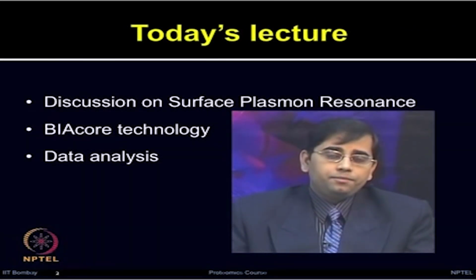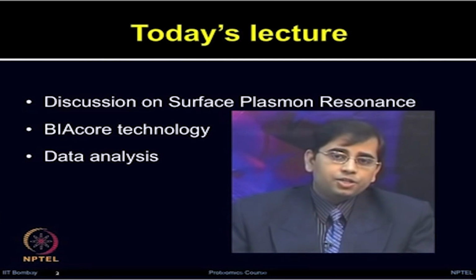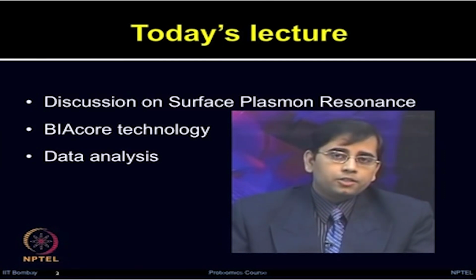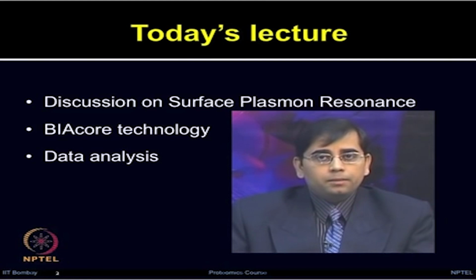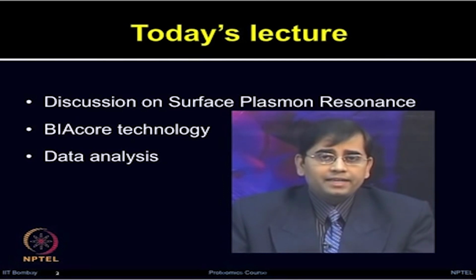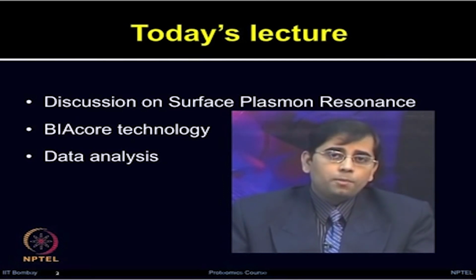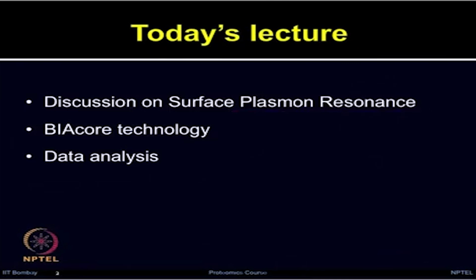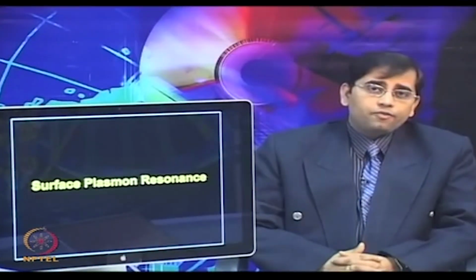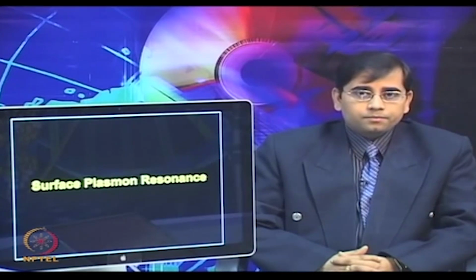So, in today's lecture, we will have a discussion on surface plasmon resonance, and I have invited a guest to discuss the Biacore technology as well as how to perform some data analysis using commercial software. So, now let us discuss surface plasmon resonance.